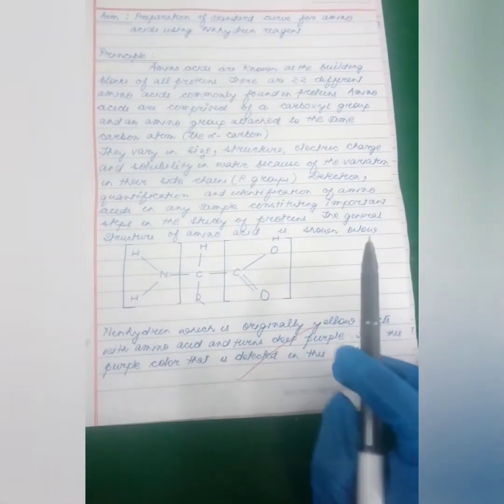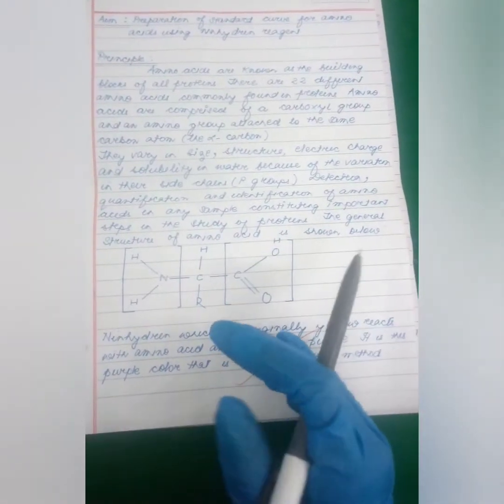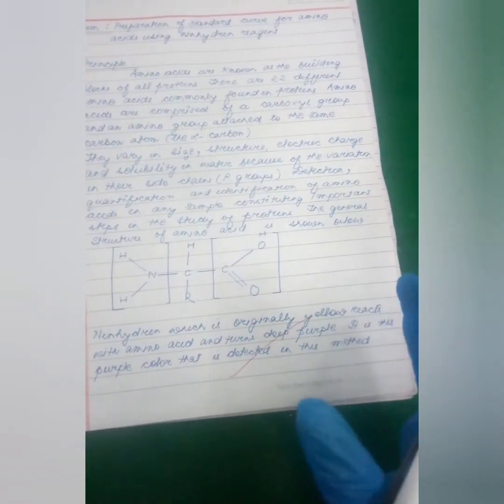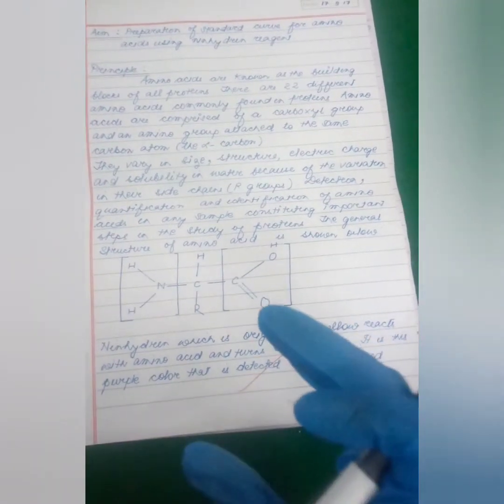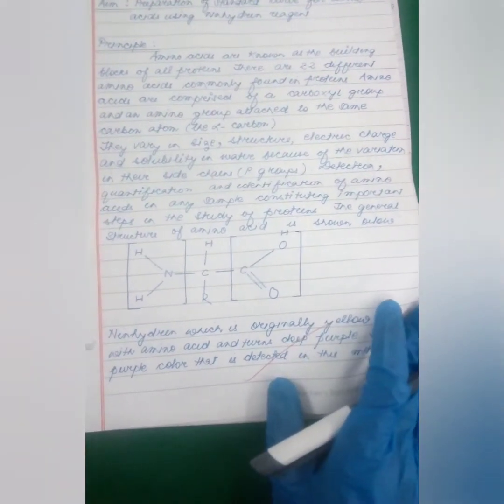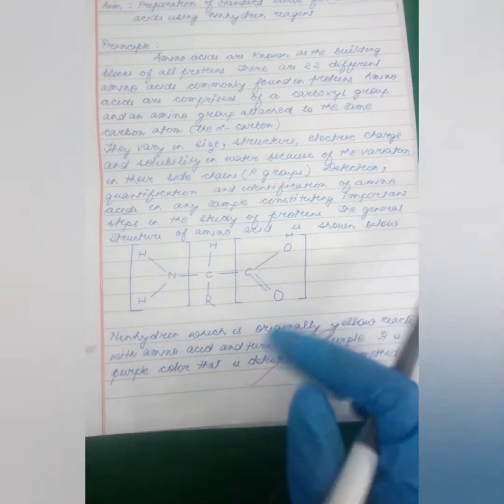When we studied the chemical properties of amino acids, we know that the Ninhydrin reagent reacts with amino acid, and as soon as it reacts, it turns deep purple in color. This deep purple color is what is detected in this method.